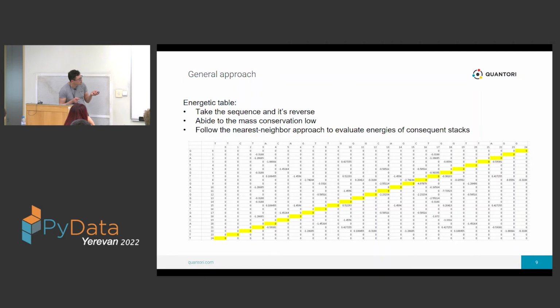TA, GA, CT and GG. So it produces some energy which is below zero, right? But the next letter, which is coming into the sequence, produces a non-complementary structure, and the energy is zero, therefore.